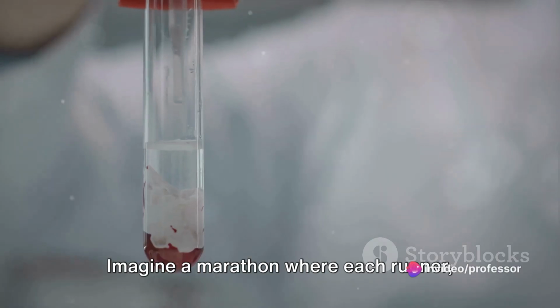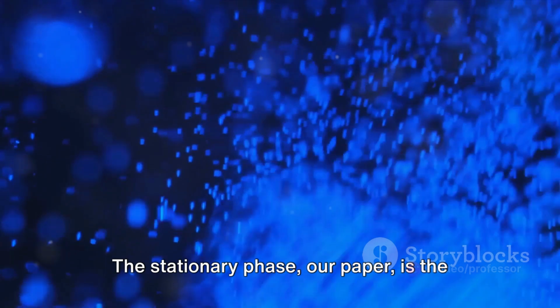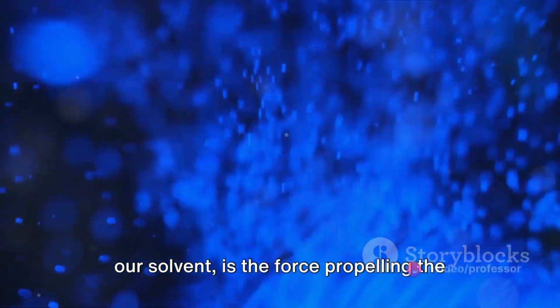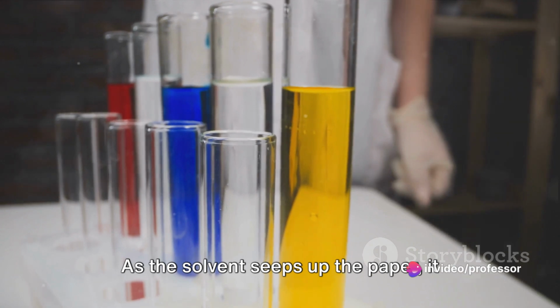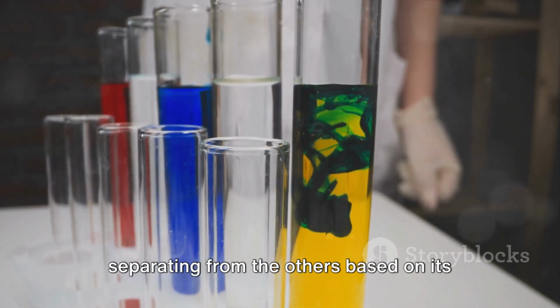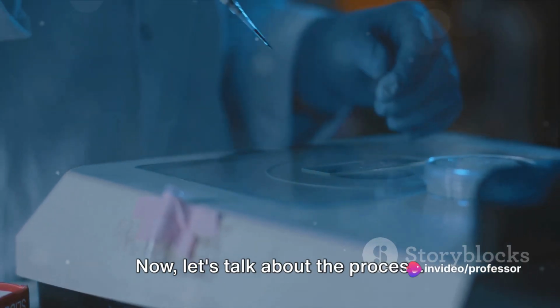mobile phases. Imagine a marathon where each runner, representing a component in the mixture, has a different speed. The stationary phase, our paper, is the marathon track, while the mobile phase, our solvent, is the force propelling the runners forward. As the solvent seeps up the paper, it carries the components of the mixture along with it. Each component travels at its own pace, separating from the others based on its own unique affinity for the stationary and mobile phases. Now let's talk about the process.